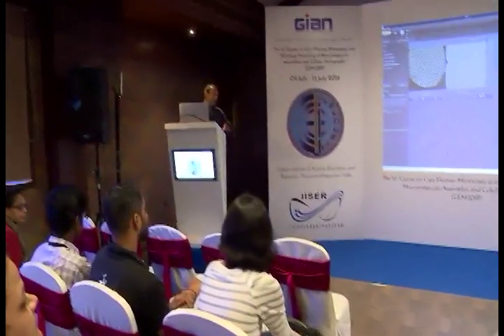Essentially, we set up a tableau with a certain detail. And then it takes this tableau, and once the tableau is taken, the software itself suggests or gives correction parameters. But do we get a lot of advantage and benefit from the Cs corrector?